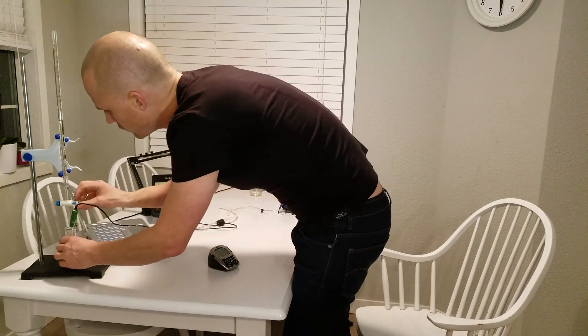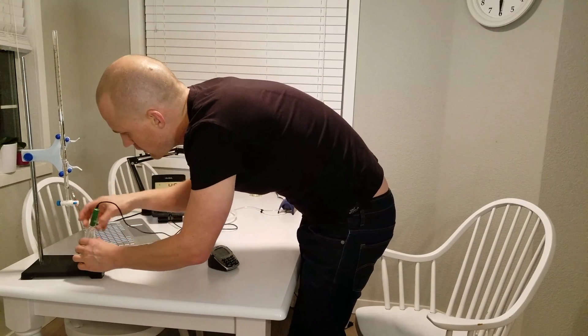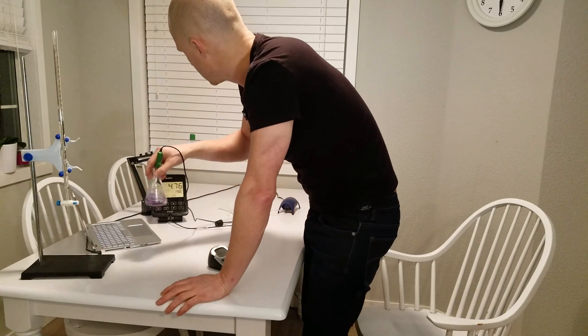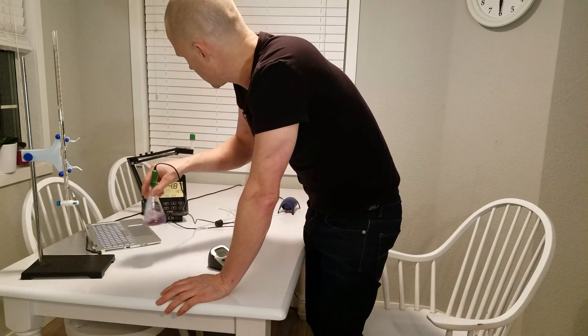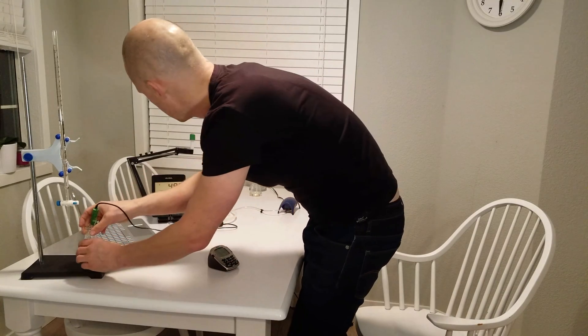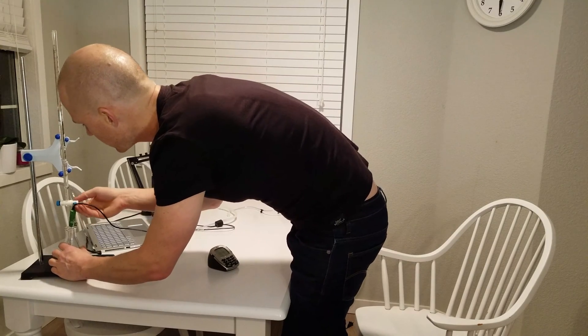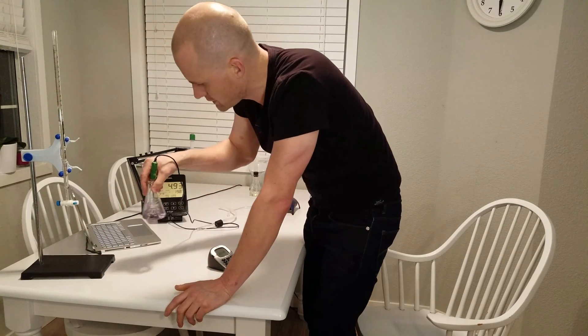I start at 13.2. We're getting very close — we're at 4.9 now. The quicker you spin it around, the less you put in.